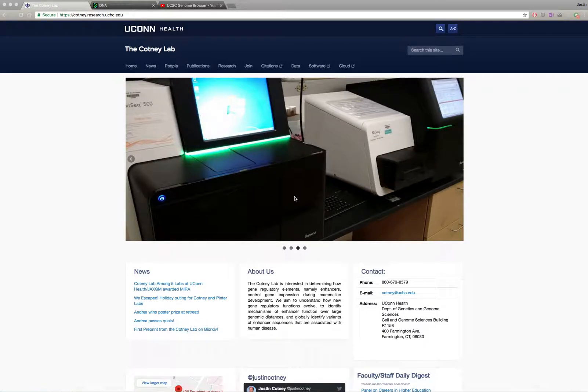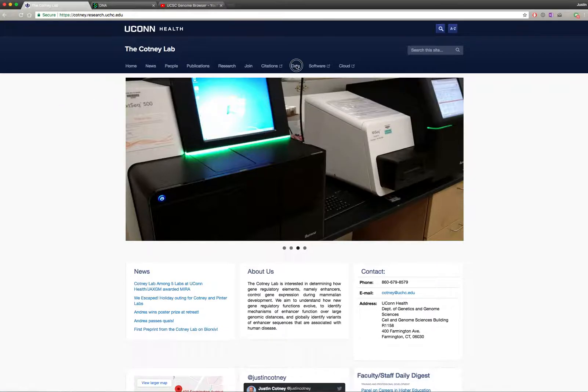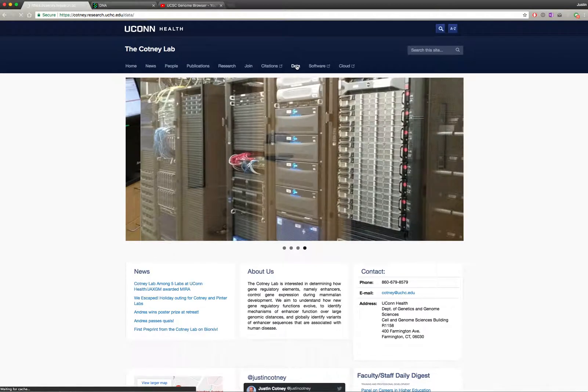Welcome to the Cotney Lab. Thank you for your interest in our human craniofacial epigenomic atlas. You can locate our website here at cotney.research.ucsc.edu. If you're interested in our data, you can simply go to the data tab.